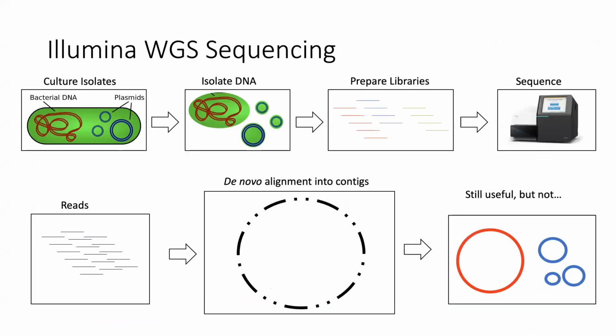I'm working under the assumption that most of the individuals on the call are familiar with Illumina sequencing. So if I'm going to talk about nanopore sequencing, I want to share how Illumina sequencing works so that we all start out on the same page of how they're different. So for Illumina sequencing, somebody gets sick, a bacteria is isolated from that patient and it's cultured on a dish.